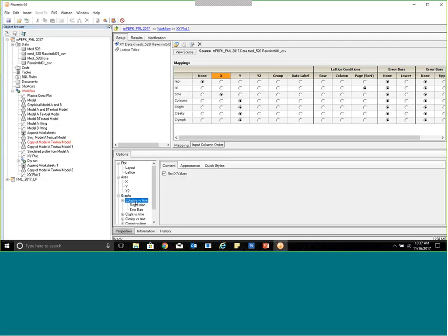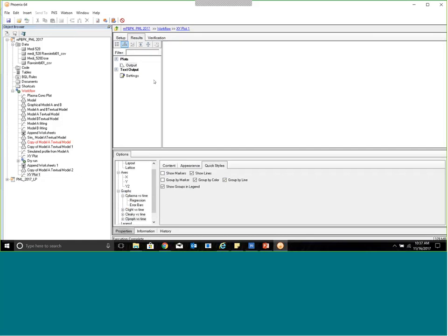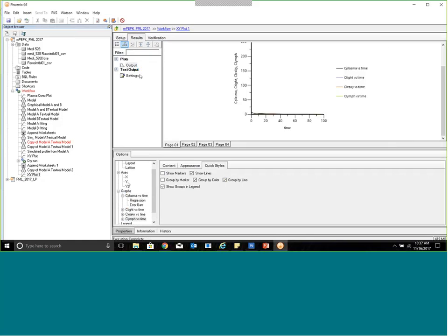And there are tons of data time points that we just simulated. You don't want to show markers on the profile. It's messy. So we will uncheck the markers here. Let's see. Right.